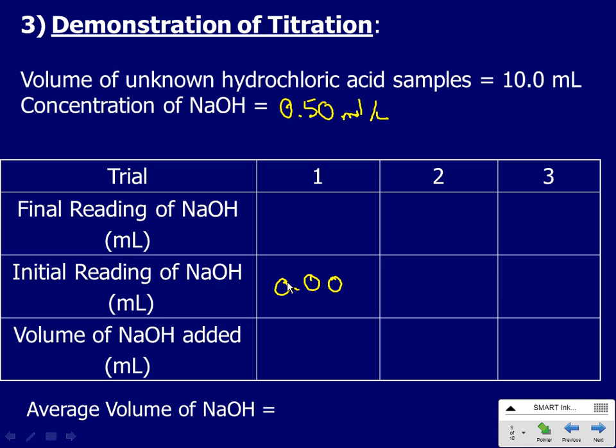So we'll start another titration, and this can happen. So paper in behind here, we are at 13.35. Getting rid of these. Oh yeah, it's great, isn't it? 13.35. That is my new value. Let's try again. And very often titrations will be no good. You've got to reload and do it again. I might have to reload one more.